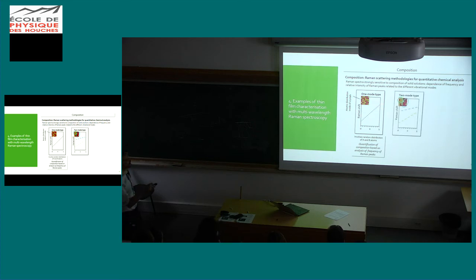But you can have two-mode type. Then what happens is you have a segregated distribution of the different atoms. Then you have two modes in your system. You introduce an additional mode.